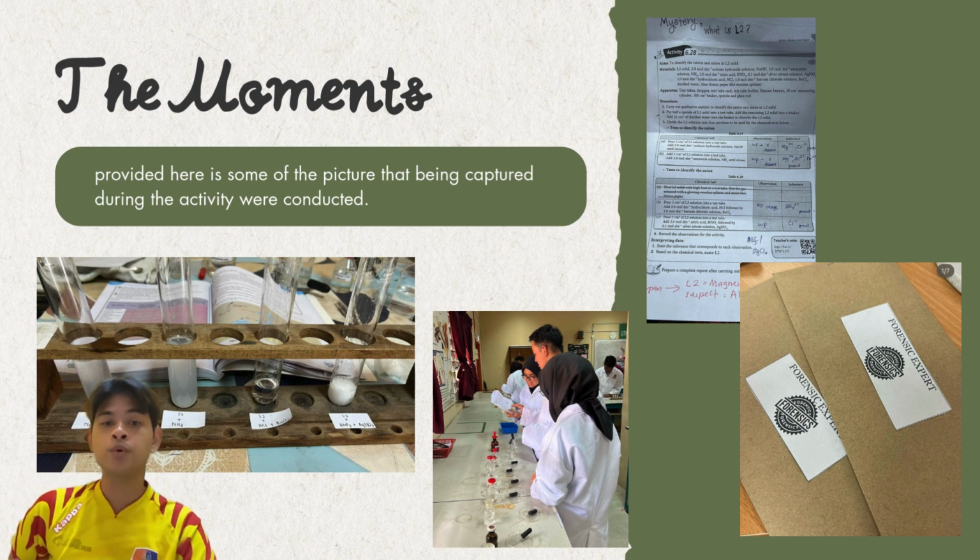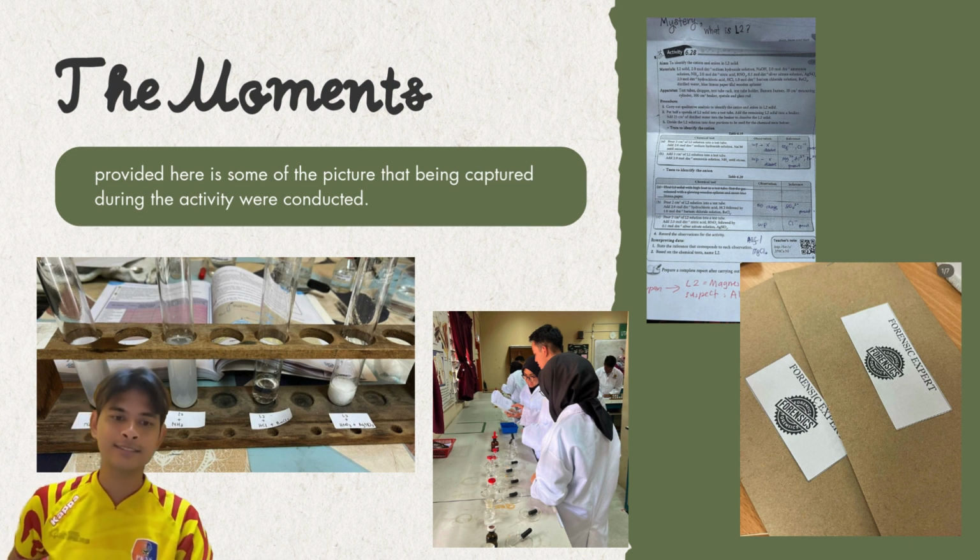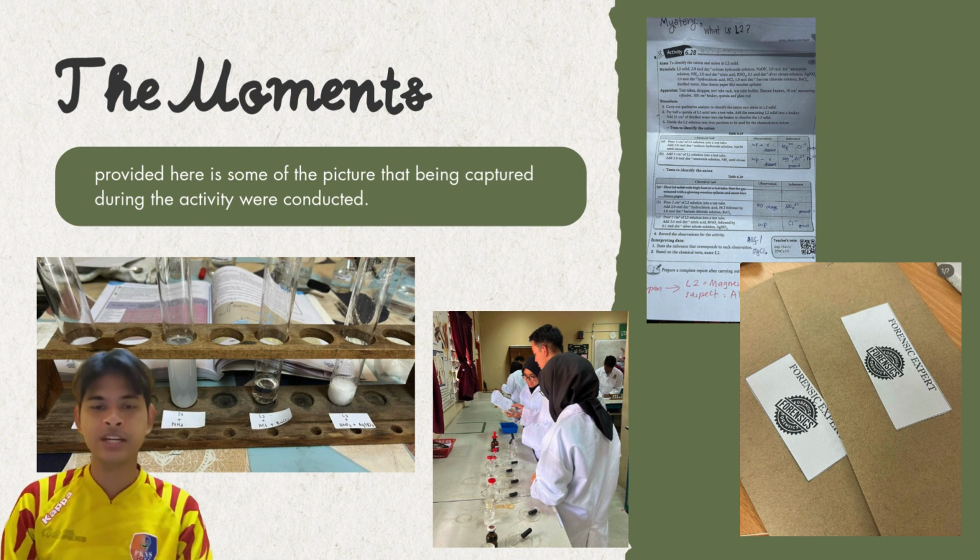So these are the moments that were captured during the activity, when the activity was ongoing in the classes. You can see the pictures here.